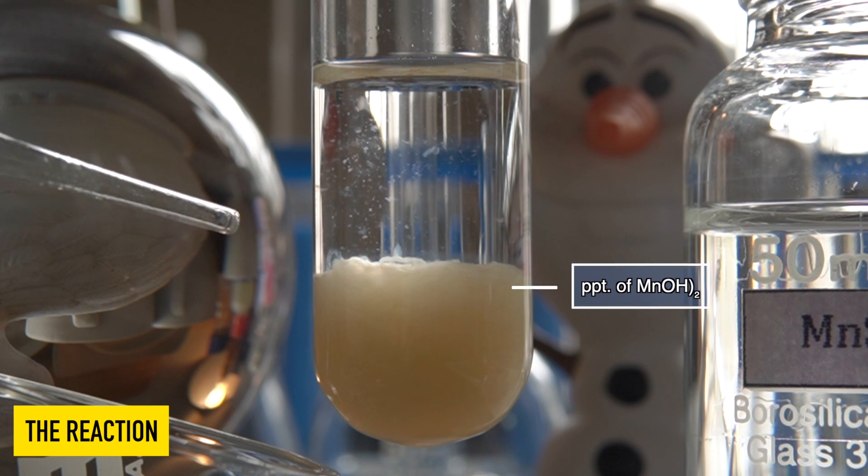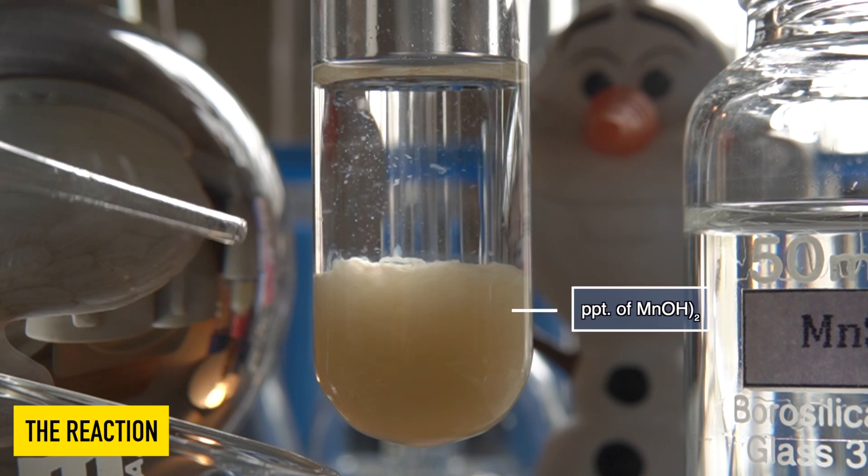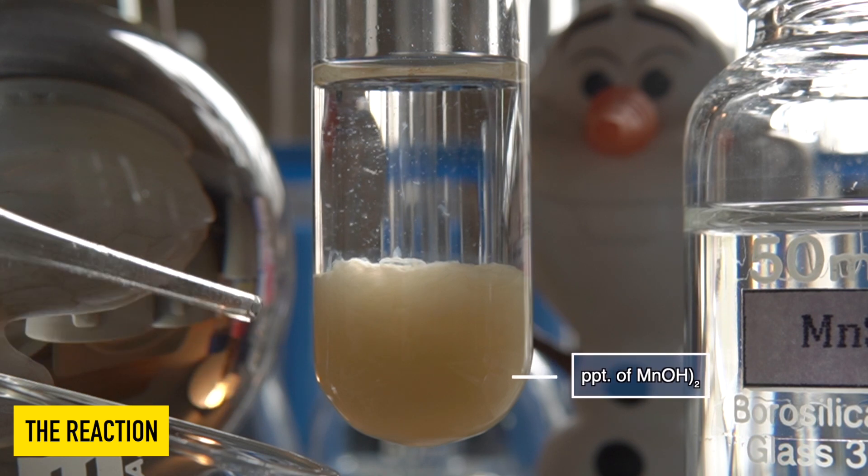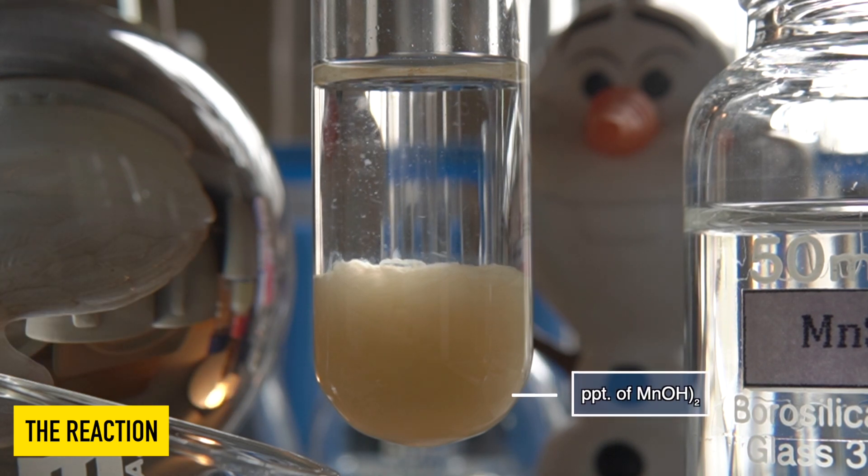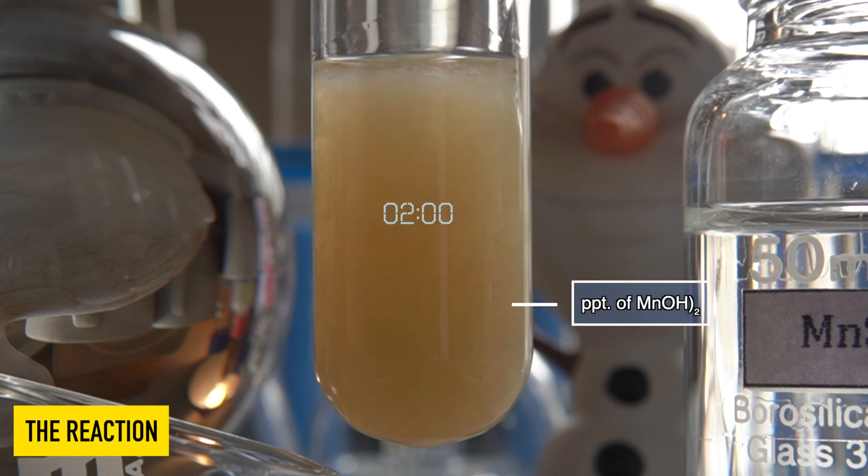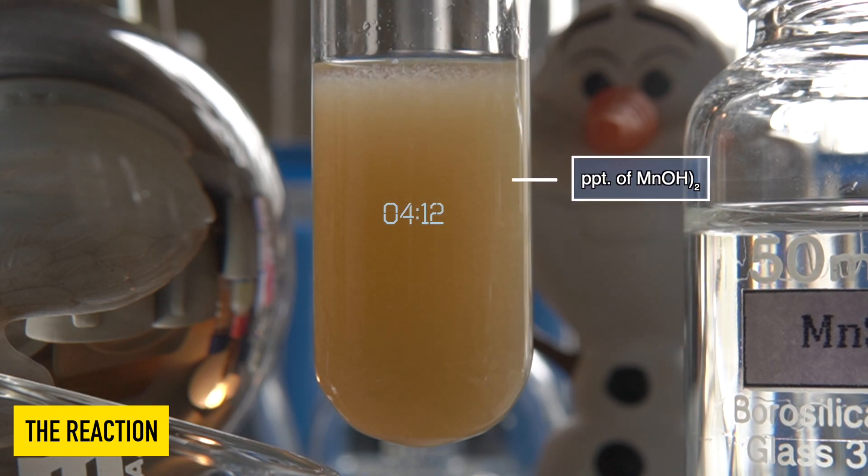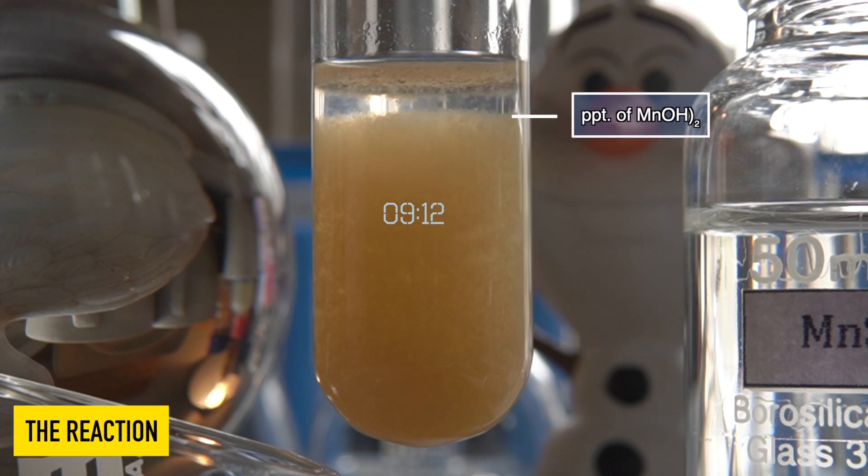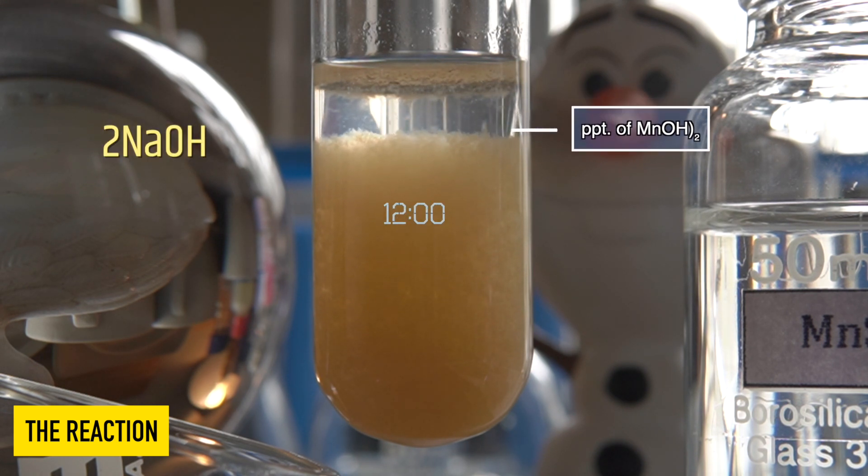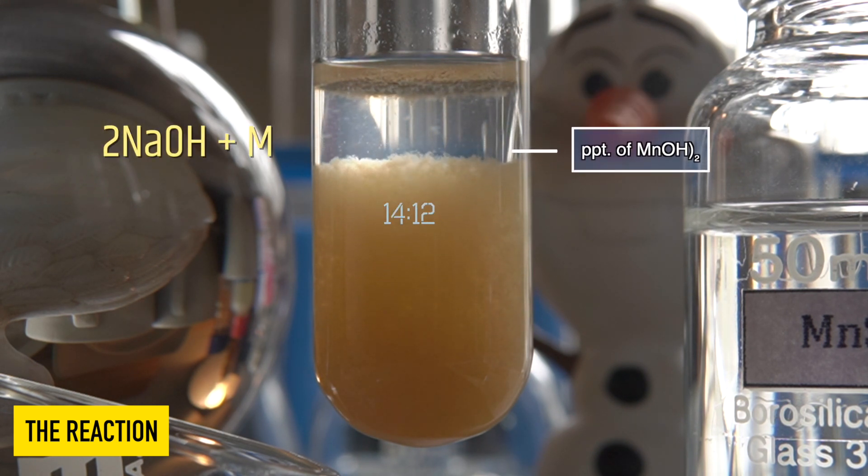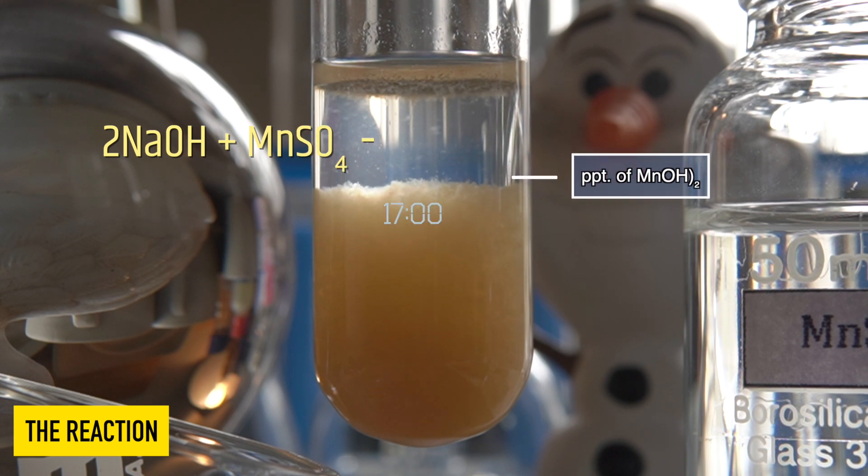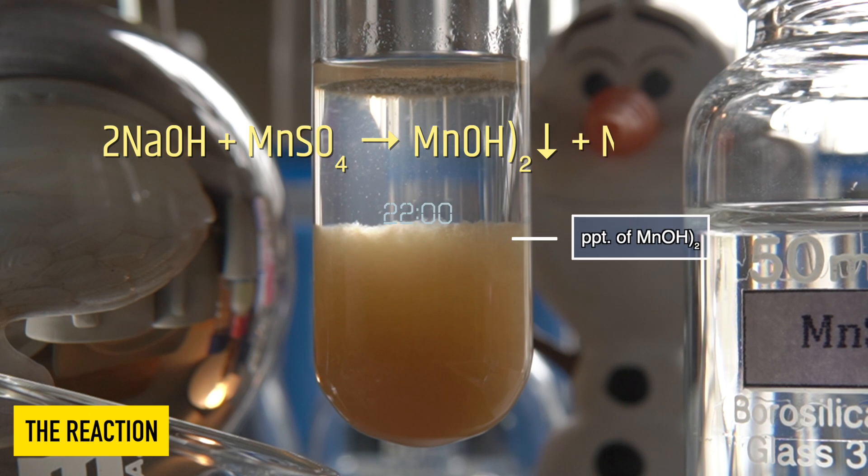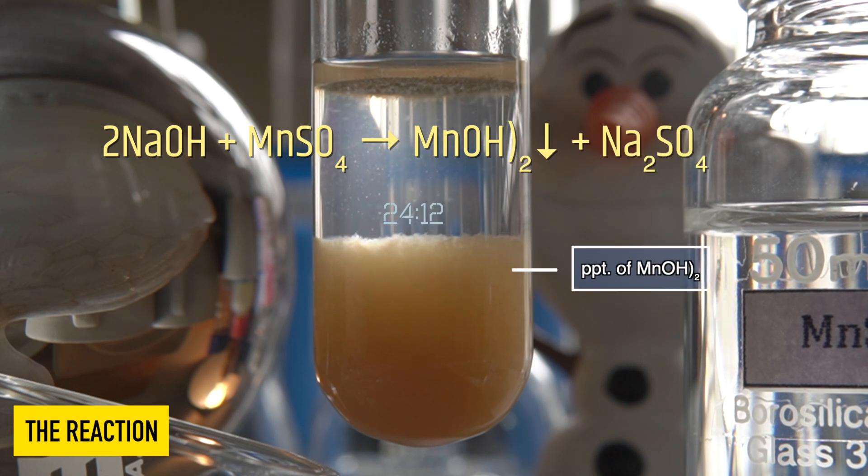The brownish insoluble precipitate that has formed at the bottom of the test tube is manganese(II) hydroxide. In this reaction, sodium hydroxide reacts with manganese(II) sulfate to produce an insoluble precipitate of manganese(II) hydroxide along with sodium sulfate.